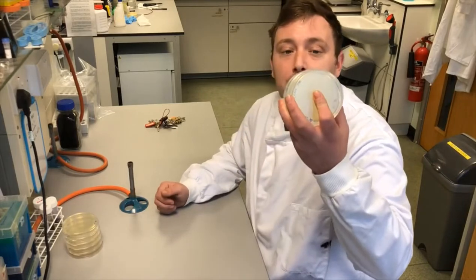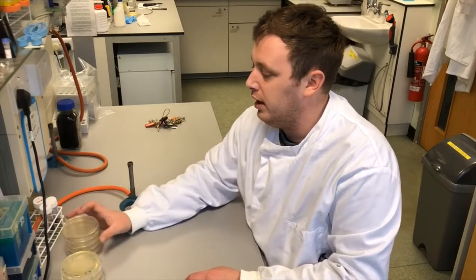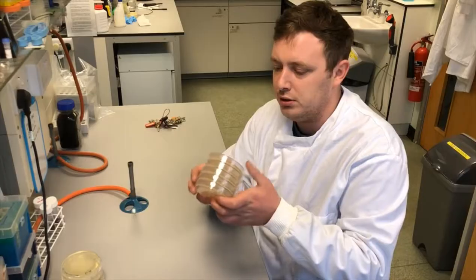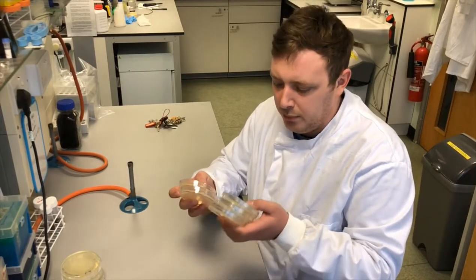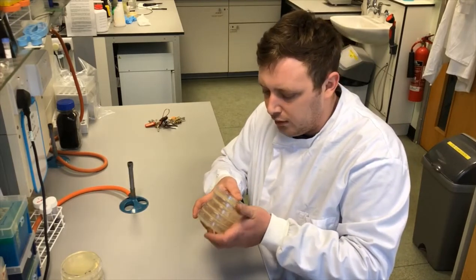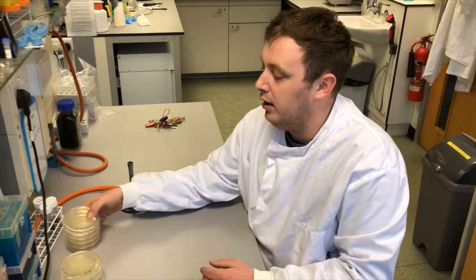Hi everyone, so today we're back in the lab to have a look at the plates. They've been left for 24 hours overnight. We've got the stack out of the incubator stored at body temperature, and the stack of plates that were on the bench. The plates on the bench don't seem to have cultured anything yet, but this isn't uncommon — environmental samples left at room temperature usually take a couple of days to get going. I'll come back in about five days and check those again.